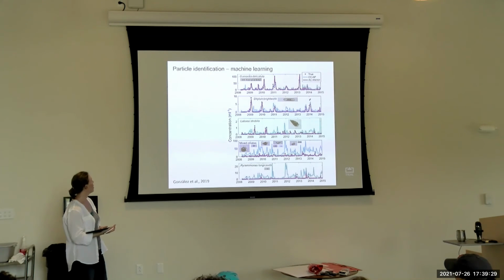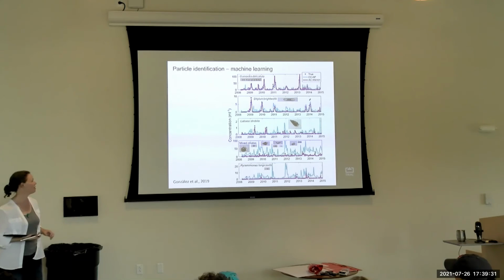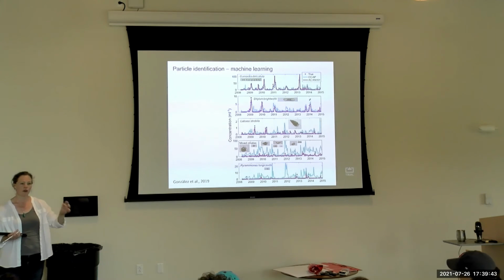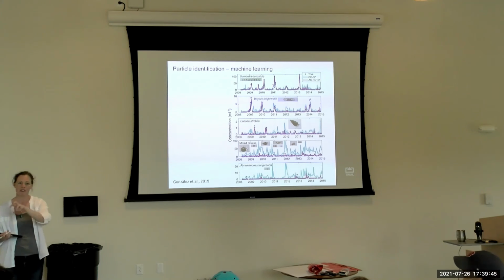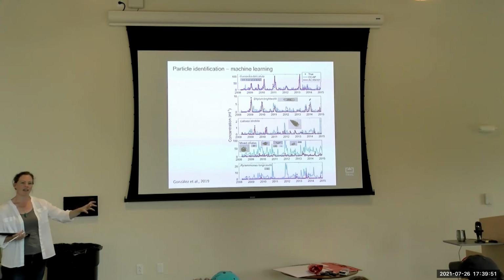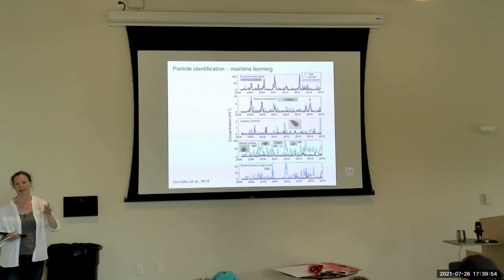But I wanted to show one example. This is again using IFCB data and comparing two different machine learning approaches. One that's training the machine learning algorithm to correctly identify individual images, and then another algorithm that's training it to correctly assign the right proportion of classes across a sample, right?